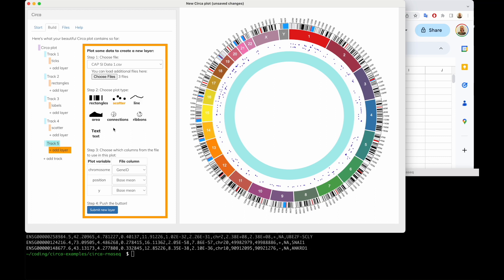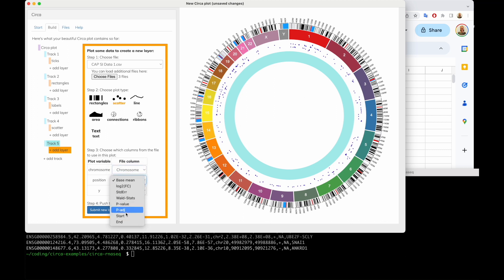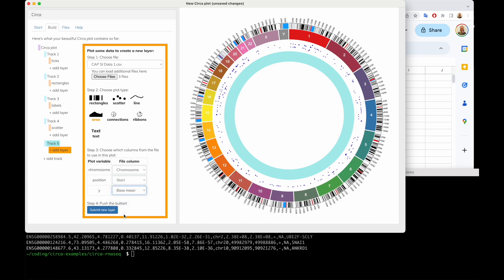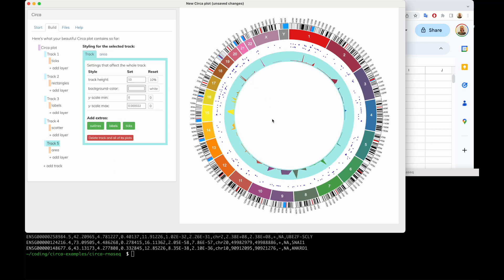Let's say I want to do the p-values next. I can also do adjusted p-values — I'll just do the regular p-values for now. We're again going to set chromosome and then the start position. Let's make it an area chart. I have to choose these again. P-value. Just to show you that you can also do an area chart.